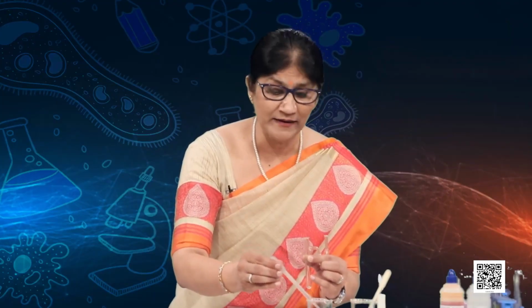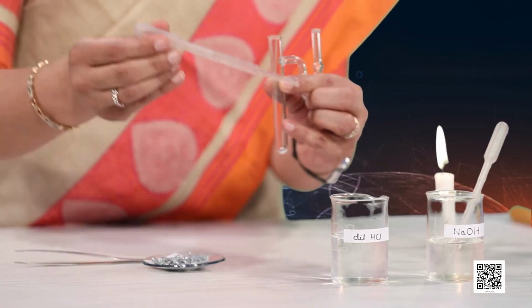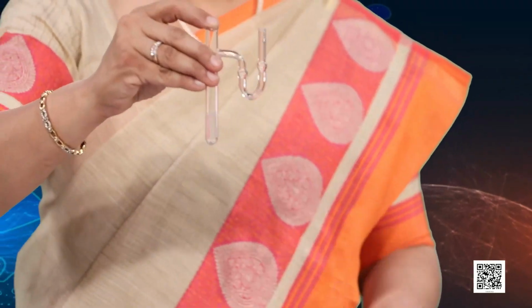My dear scientists, this activity is to be done in the presence of the teacher, or it can also be a demonstration activity with your teacher. Only with adult guidance you have to do this. So now I am putting some dilute HCl to this, and on this end of the U I will put some soap solution. So this is some soap solution that I have with myself. I will put some soap solution this side in the arm of the U tube. And let us now see that the reaction occurs.